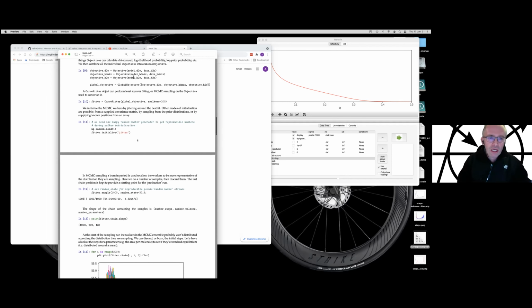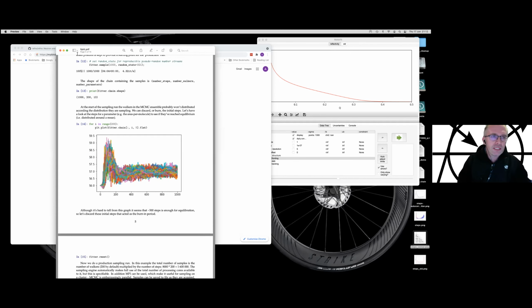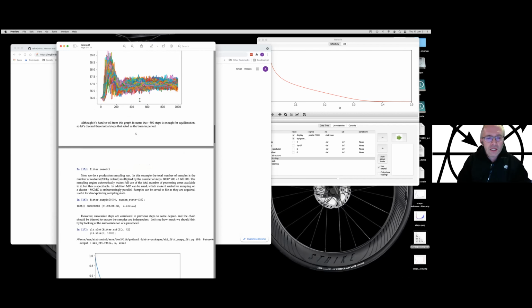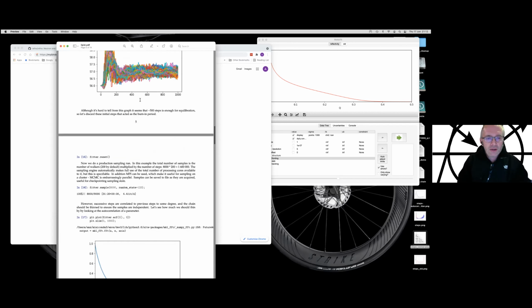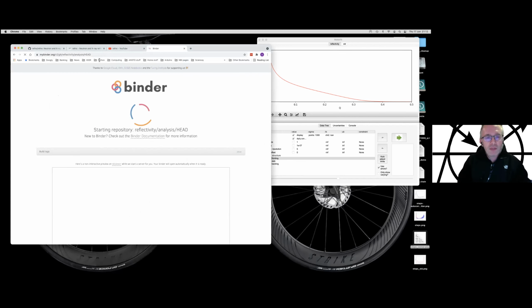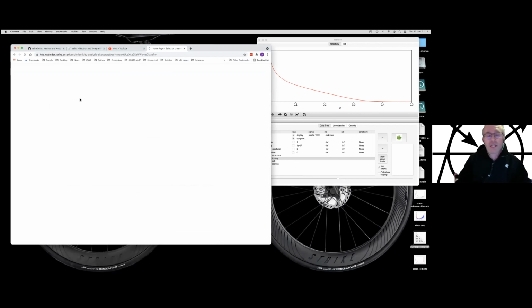But I'm not going to show you how to set up a model in a Jupyter Notebook because it's pretty difficult in 10 or 15 minutes. So I'm going to punt that to homework, where if you're interested, you can open that up and see if you can reproduce it. One advantage of the Jupyter Notebook is that you can also run them in Binder instances, an online resource for running Jupyter Notebooks.